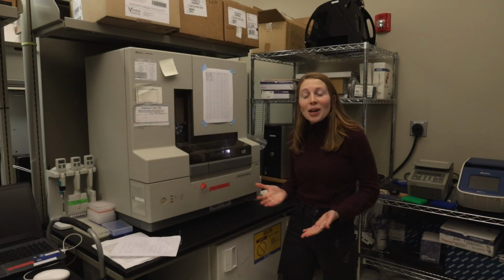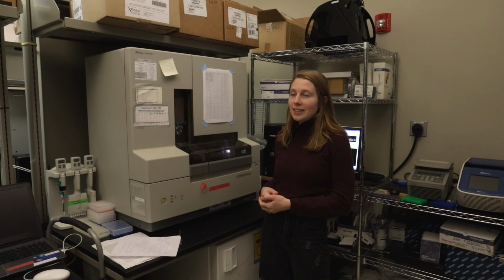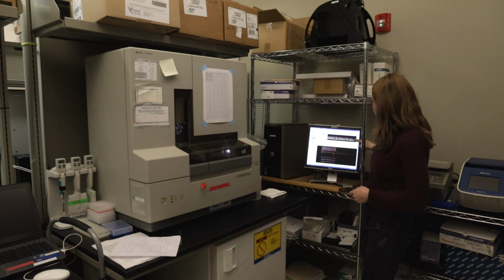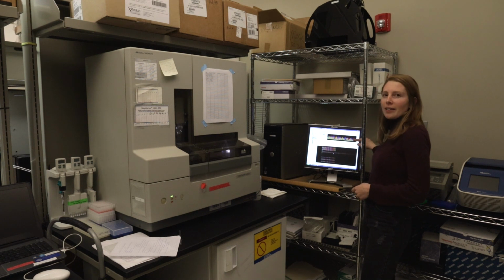So how do we look at a readout from a Sanger sequencer? Here, sequencing is currently being done. And so on this screen here is the readout of the fluorescent tag. So we're going to zoom in on that.